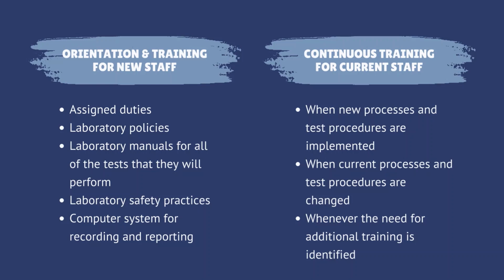Every facility is different, and regardless of how much lab experience an individual has, new staff must be trained in the following areas, which are their assigned duties and responsibilities, lab policies, lab manuals for all of the tests that they will perform, lab safety practice, and computer system for recording and reporting.